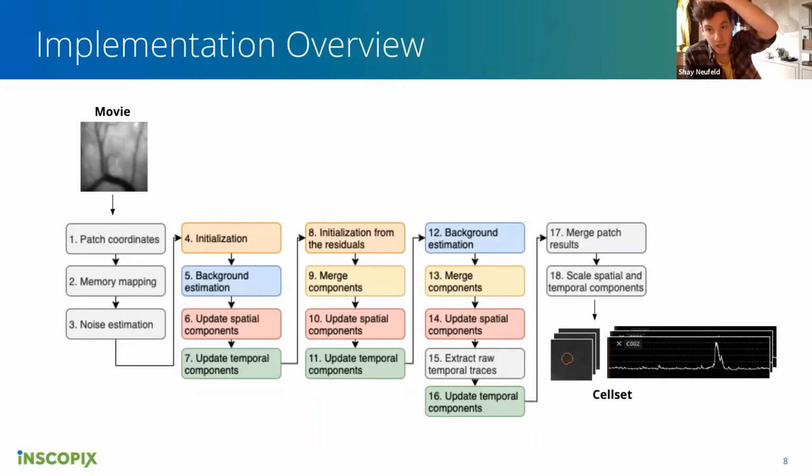Now, not to say that we can't make these slides available to you, but I think most of the figures you see today will be in the CNMFE section of the new manual. Yeah. Okay. Yeah, we can crop them and put them in our presentation. Yeah. And there's actually even more detail in the user manual for the release of 1.6. So I'm not going to go into each individual module today, but there is information about how each module works in the user guide. I have this diagram, and I go through all 18 modules so that you know exactly what's going on.